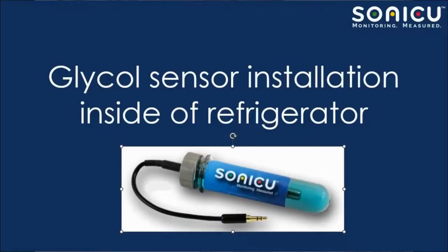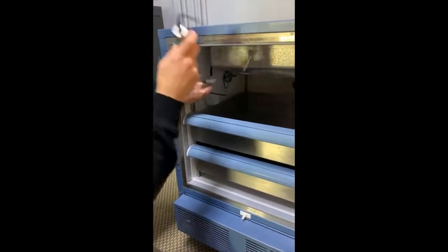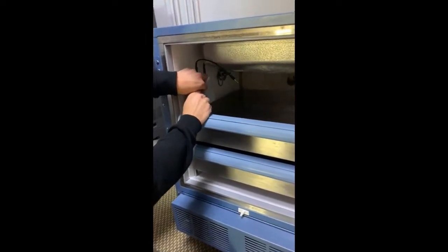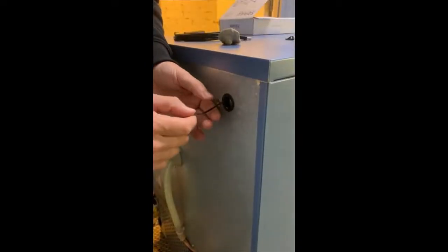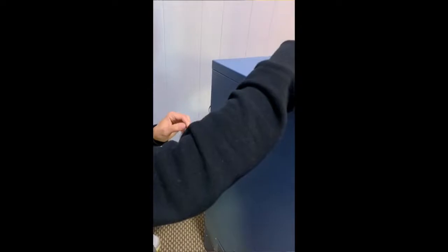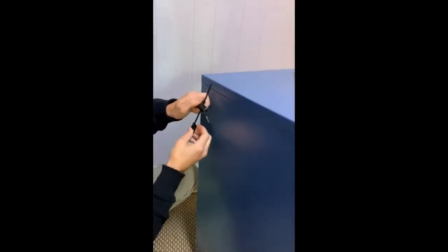Inside your appliance, choose where you want to place your Sonic U sensor and secure the sensor in place with zip ties. Run the included flat extension cable through the port and plug the extension cable into the extensor. Complete the cable management and secure the cable in place with another zip tie and tie block.